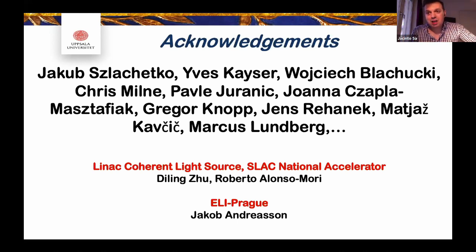In terms of damage, what was really nice for us is that you could use the emission to track damage in your sample. If you are able to measure one of the emissions that is not very sensitive to the chemistry you're interested in, but is sensitive to the structure that you have there, then this is a very good reason to measure RIXS. Even if you don't need the RIXS for anything else, this allows you to say you are under intact conditions, and the data you're extracting are really data associated with your chemistry, not something else that is happening due to beam damage.